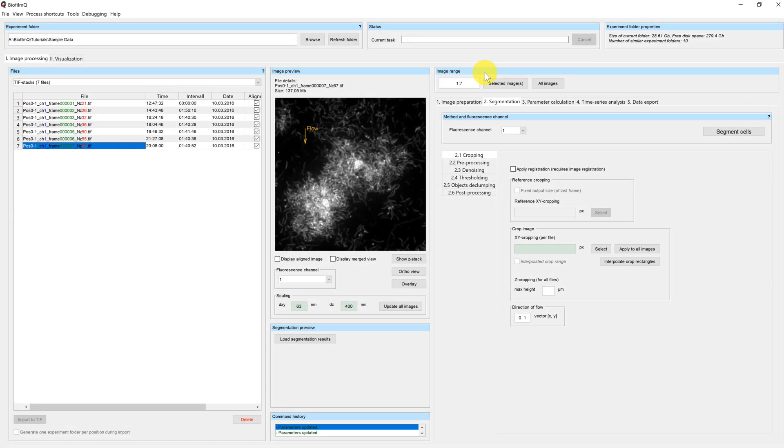Welcome to this tutorial of BiofilmQ. I'm Miriam and I will explain how to crop your images. By cropping the images we will define our region of interest.